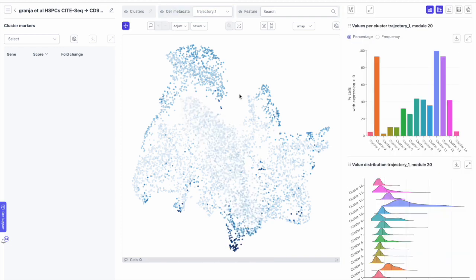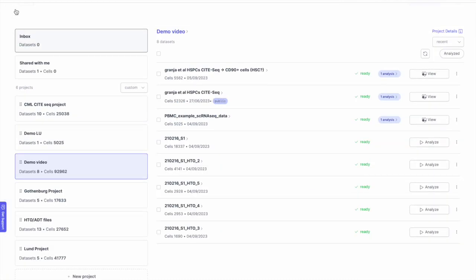So these were some of the features that ScarfWeb include, and if you want to learn more about other features or try this tool yourself, I suggest that you create a free account on our website and try the demo data that are there. There are also free uploads for 1 or 2 files that you could use and try your own data. So I will end this demo by going back to the project page and show how this could be used as a portal for the data you have created and analyzed.